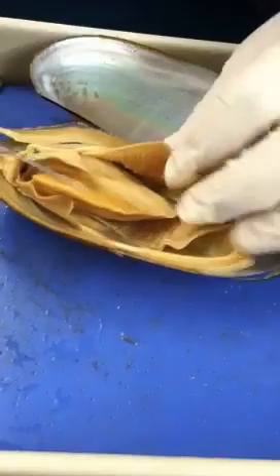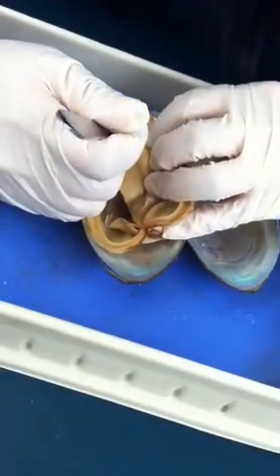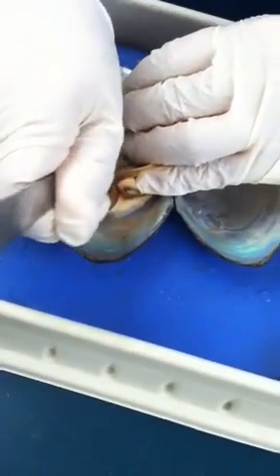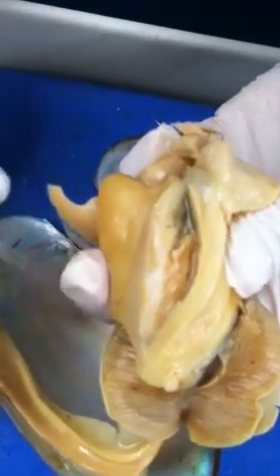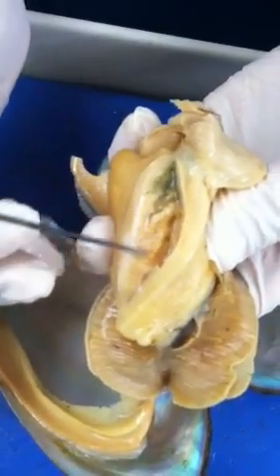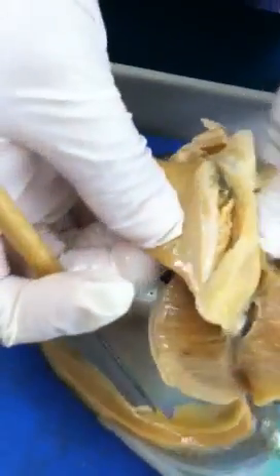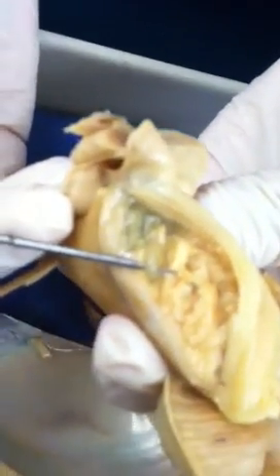After we identify all those, we need to cut the clam open to see the digestive system. Cut from the mouth all the way to the bottom. After you cut it, you can expose the inner structure. You will see a very distinct green color — that structure is the digestive gland. Everything below it, the meat of the clam, those are gonads. And here you will see a very clear tube — that's the intestine.